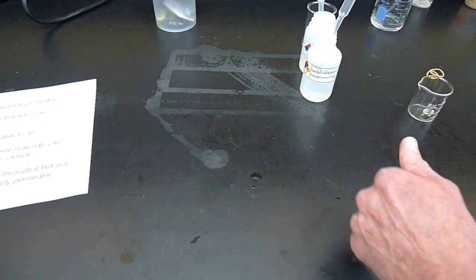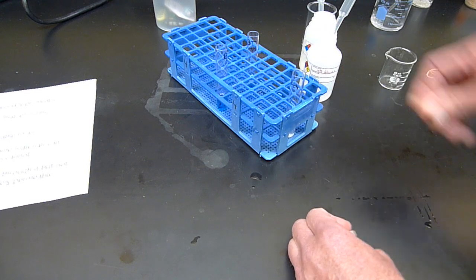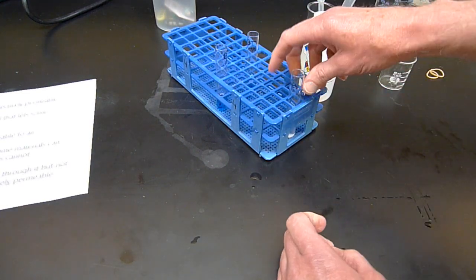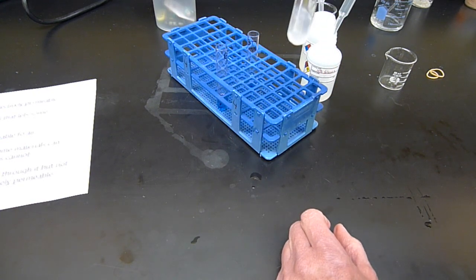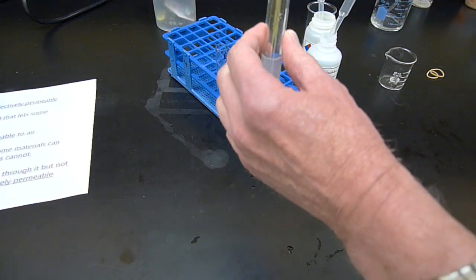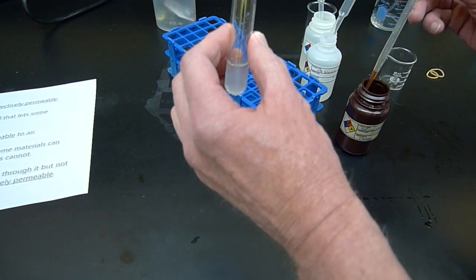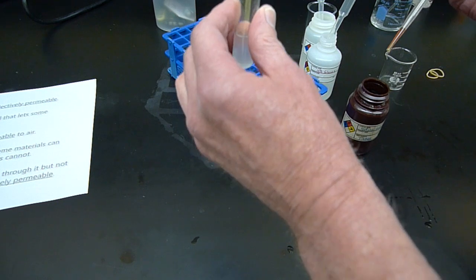So we're going to have to analyze for glucose and starch. In order to do that, we're going to use some of the chemical tests you've already gotten used to. Let me just remind you of them. In this tube, there's a little bit of starch. It tends to settle out in the bottom of the tube because it's not entirely soluble in water. To that starch, I'm going to add a drop of iodine, because this is the classic test for starch from your chemical composition lab. I'm sure you remember really well, right?